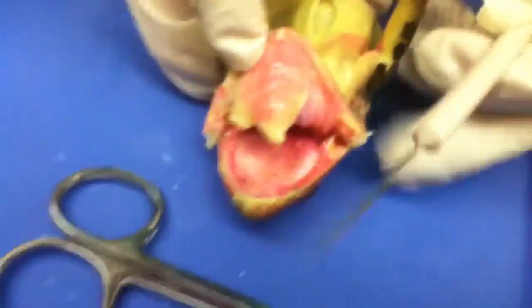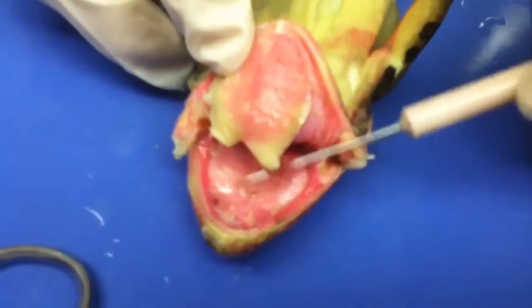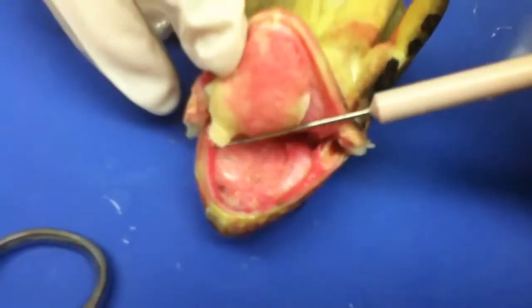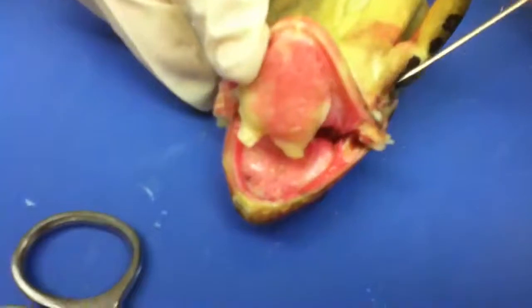Oh, his mouth is full of water. I'll bring him in. There's these 2 teeth right here that are kind of sharp, so I guess he would use those, like they're kind of like molars. But I guess he would kind of grind his mouth a little bit, I guess you could say. But I think he would mostly suck on his food or just swallow it whole.